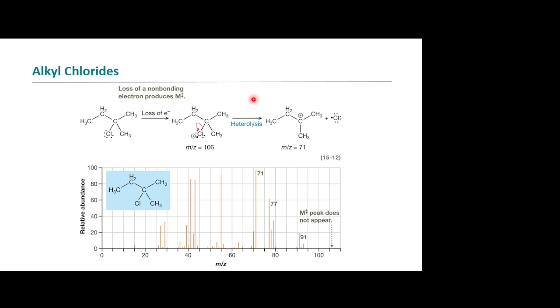Okay? And you actually probably noticed that in the previous, when you guys were asking me all those questions, and you noticed like the huge base peak. They only had one peak, right? Didn't have the two? Yeah. You were noticing the bromide and chloride being lost. Yeah. Okay.